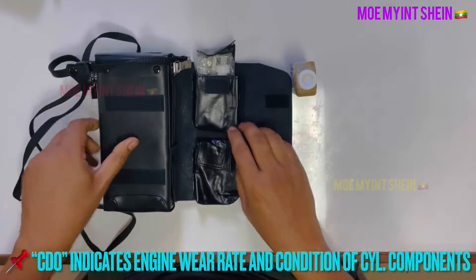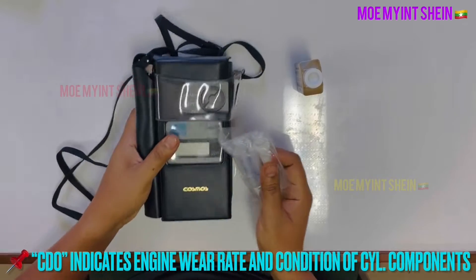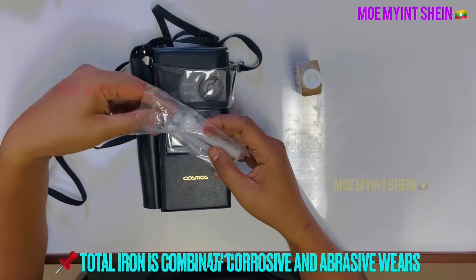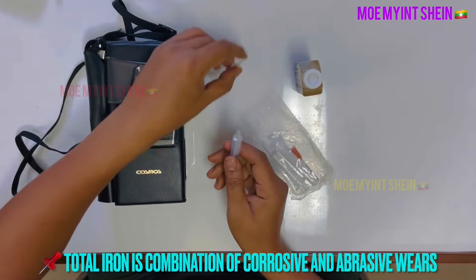The scraped down test can indicate the wear rate of the engine and the condition of cylinder components. Iron content in used cylinder oil comes from corrosive and abrasive wear.